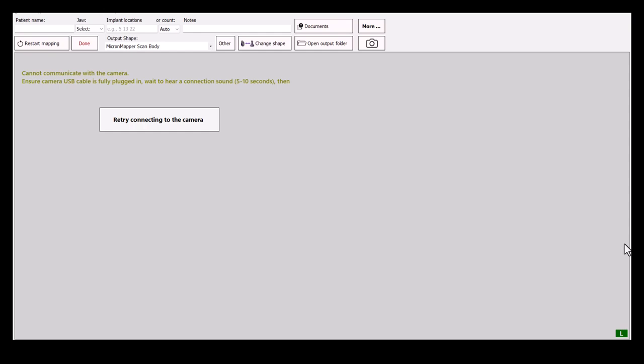Hello and welcome to Tips and Tricks of MicronMapper again. Today I will show you how to change the output shape of already existing scan.